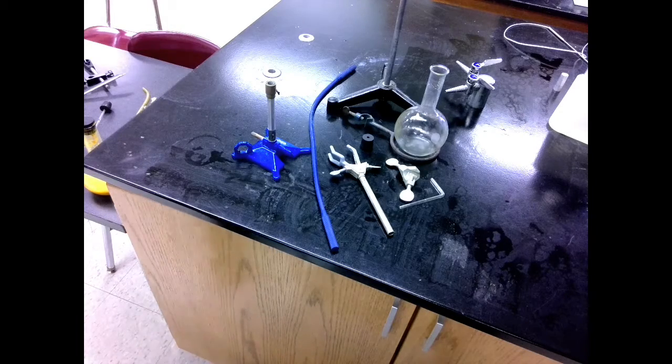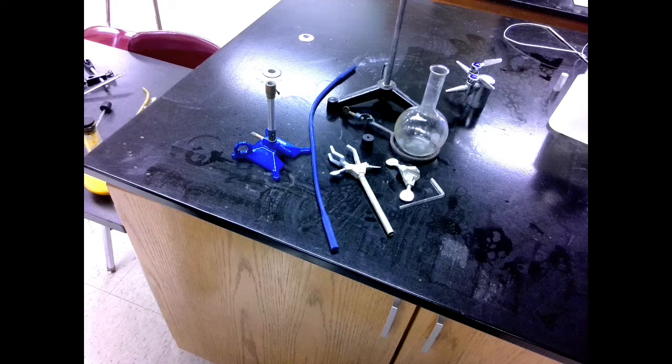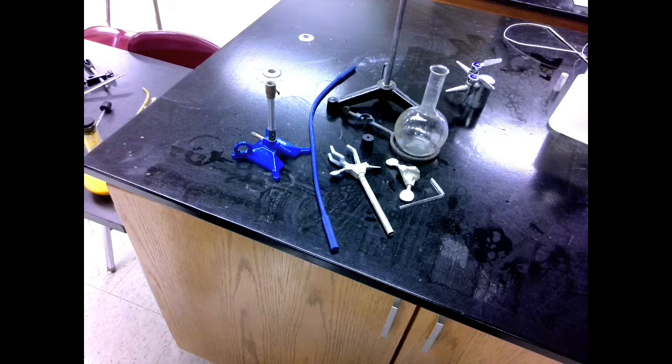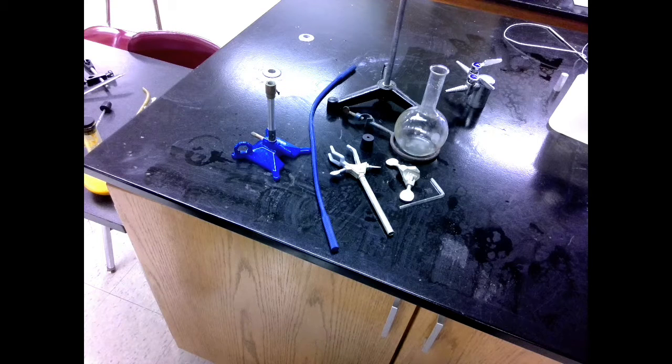The first part of our setup is going to be the steam production portion. We're using steam production because we don't want to damage the organic material. Direct heat would burn and chemically change the orange zest, and we would not get pure organic oil, which is what we're looking for.